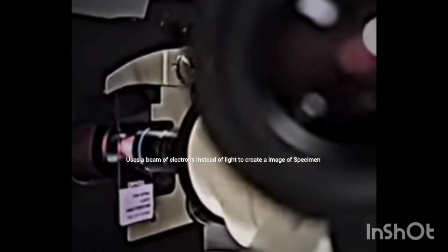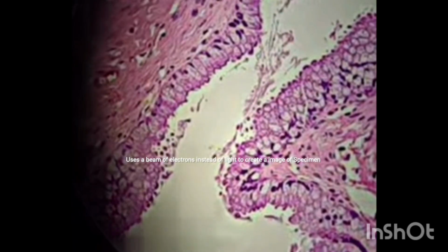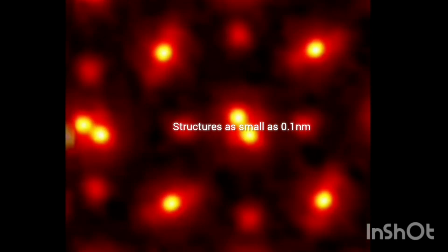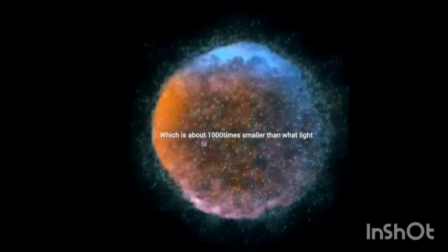What is an electron microscope? An electron microscope is a type of microscope that uses a beam of electrons instead of light to create an image of a specimen. Since electrons have a much shorter wavelength than visible light, they can reveal structures as small as 0.1 nanometers, which is about 1000 times smaller than what a light microscope can detect.